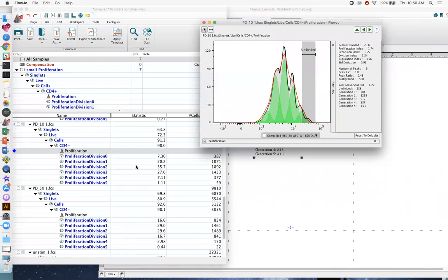But the strict number of events that you need to have in any one generation for good modeling, I can't say per generation, but I would tell you that here we have roughly 5,000 events that we're feeding into the model, and the RMS is under 5, which is really good. A general rule of thumb here is if you're under 10 and you have about 10,000 events, you're doing all right.